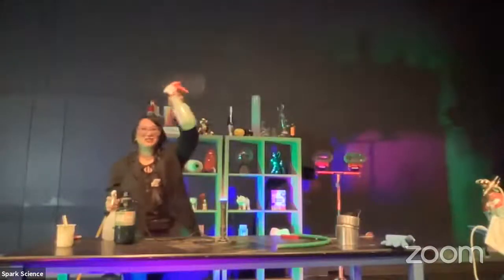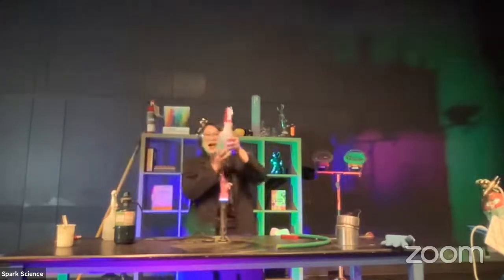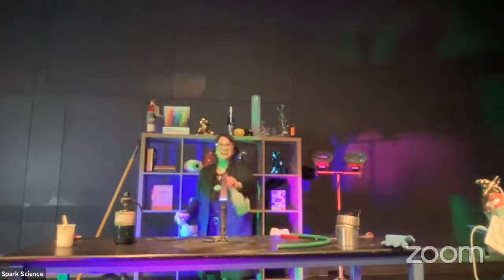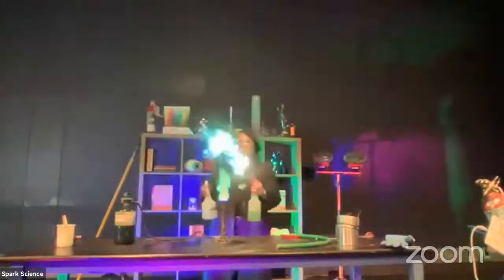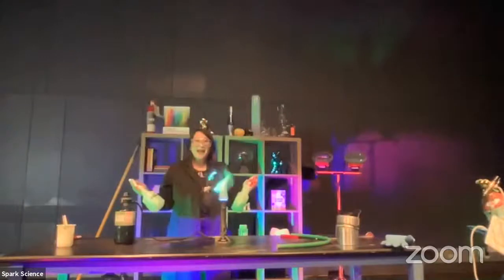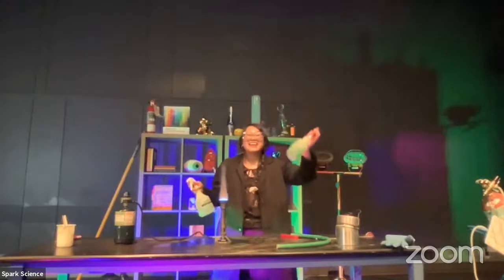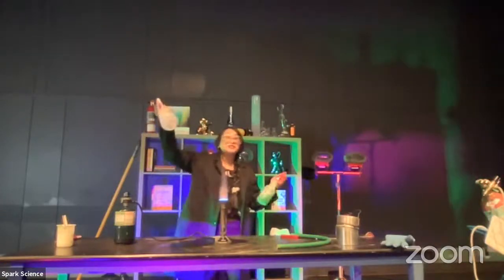Now let's test copper, another metal. We mix in the metal salts, remember? What color do you think copper will burn? Here we go. In 3, 2, 1. Ooh, very beautiful. We're getting a nice bluish green here. So now you know when you watch fireworks, if you see a bluish green color, you know that they put copper in there. If you see a nice magenta reddish color, you know that they put strontium.